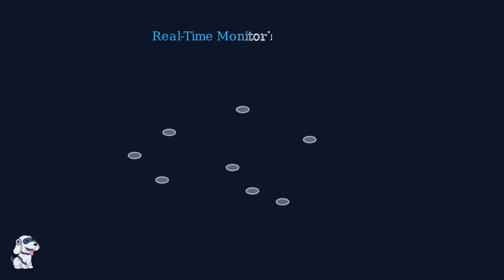To understand how bacteria react to antibiotics, scientists use a powerful tool called fluorescence lifetime imaging, or FLIM. Unlike standard imaging that just shows a static image, FLIM measures the precise time a molecule stays in an excited state after a pulse of light.